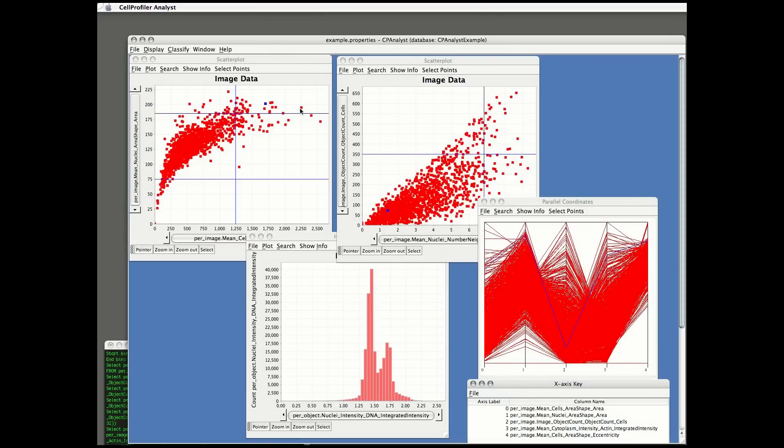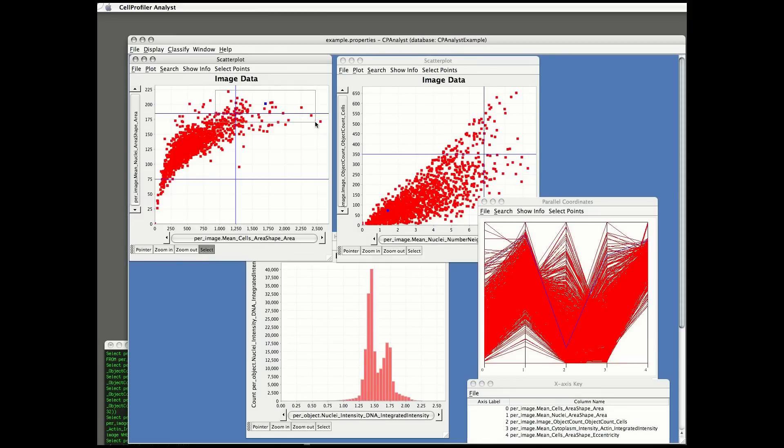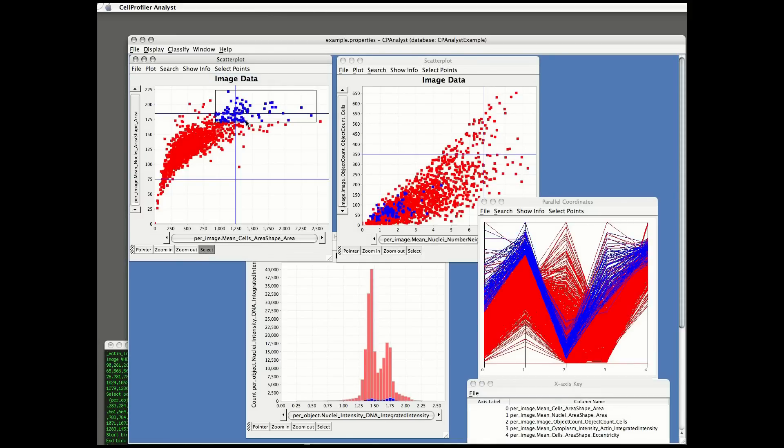Now to brush data, I choose Select and Select Points Highlight Gated up in the scatter plot. Those points now appear blue in the other plot, so I can see that the samples with high cell area and nuclear area have low object count in the parallel coordinates plot.